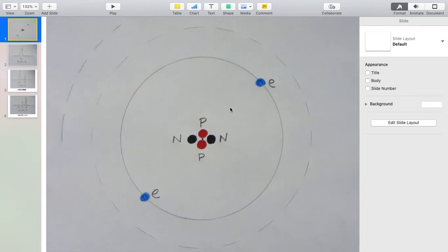First of all, I'm just going to give you a simplified model of the mass of an atom, which is the way it was first introduced to me when I was at school, and historically this was the way it was viewed. Later on we will look at the full analysis of the mass, but this gives a simpler understanding which is perfectly adequate to understand how this mass spectrometer works, although there are some fascinating things to do with the full understanding of it.